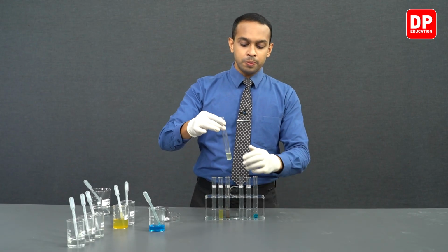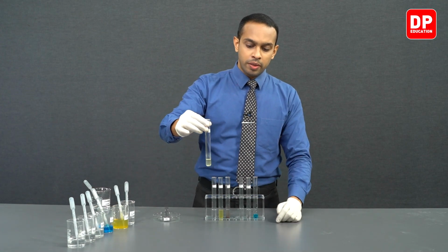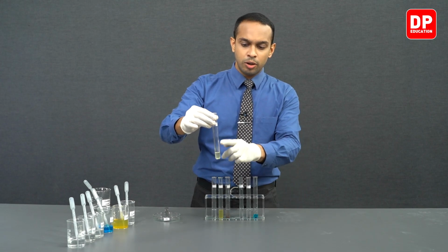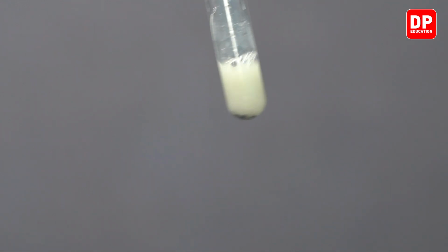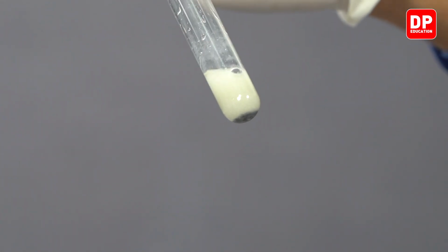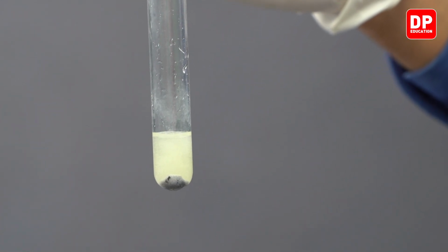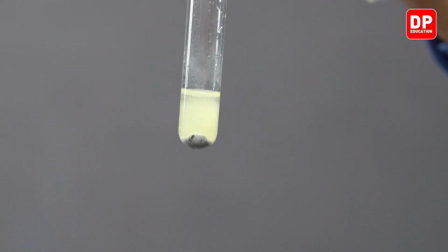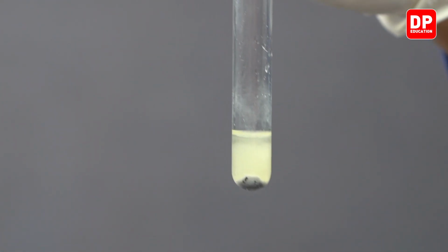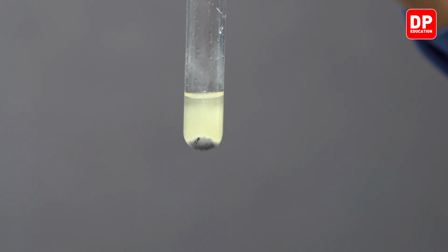And then we move on to lead 2 plus. So if you take a look at this lead 2 plus aqueous ion solution, you can very clearly observe there has been some sort of a reaction here. You can see a whitish or grayish precipitate has been formed. So this precipitate is due to lead 2 plus ions getting displaced in the presence of iron. In the presence of iron, lead 2 plus ions get displaced as lead solid or lead metal.